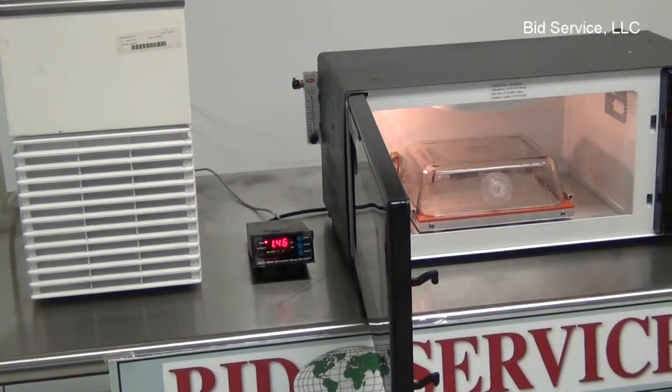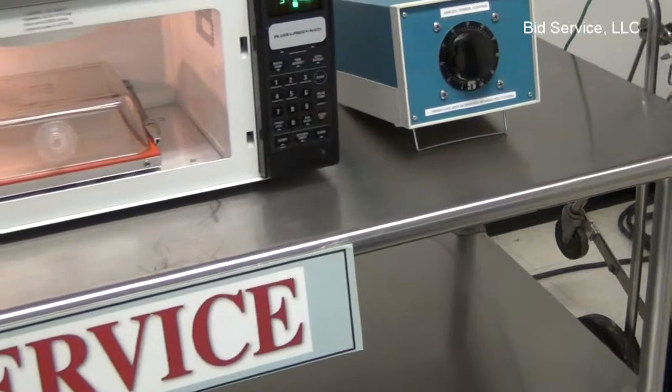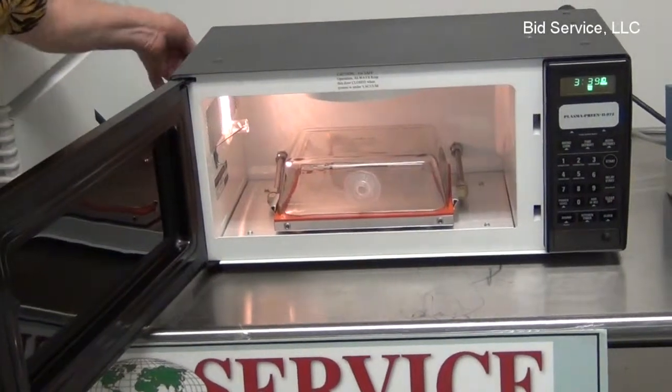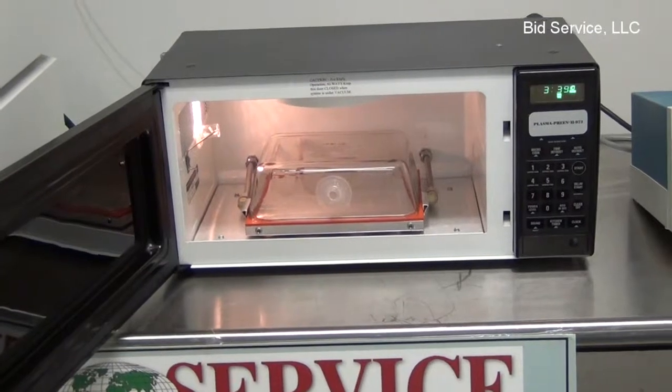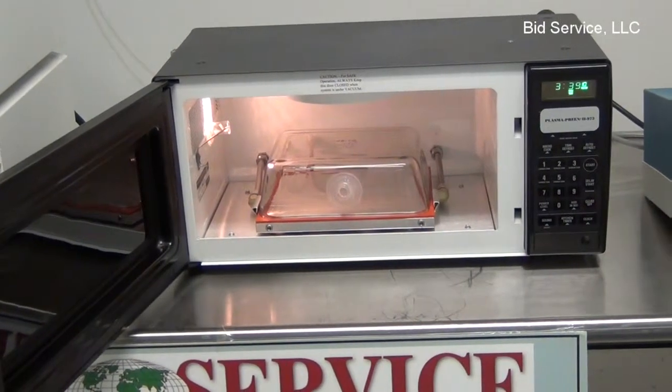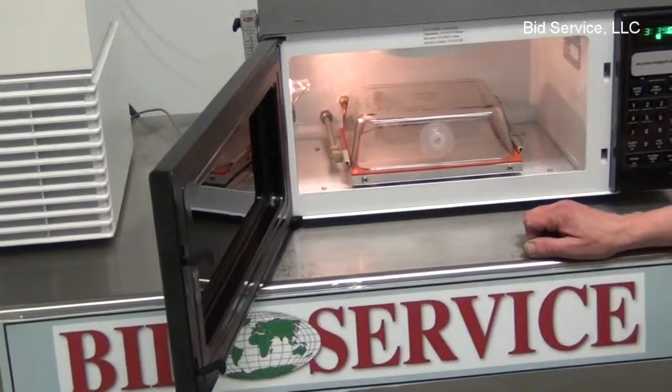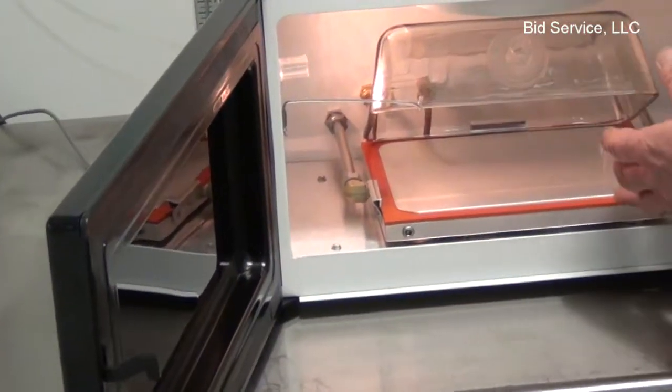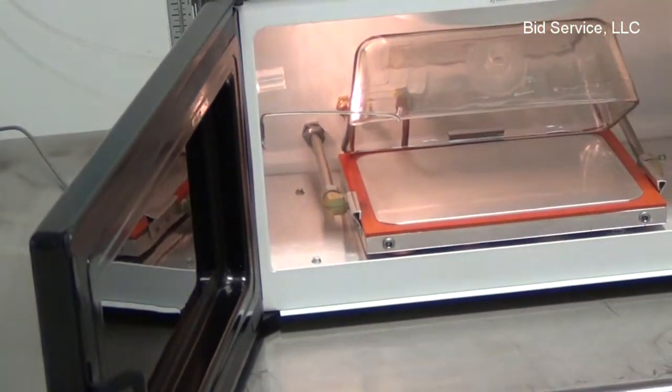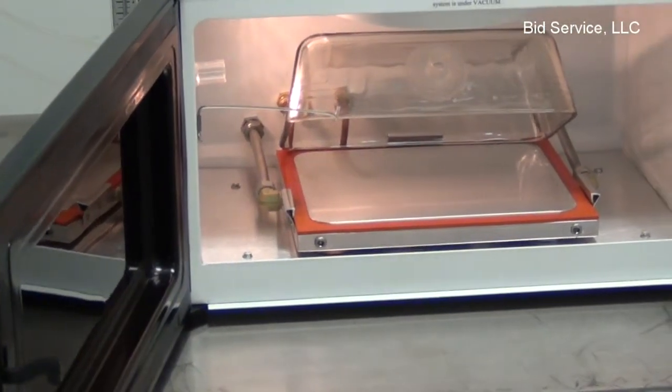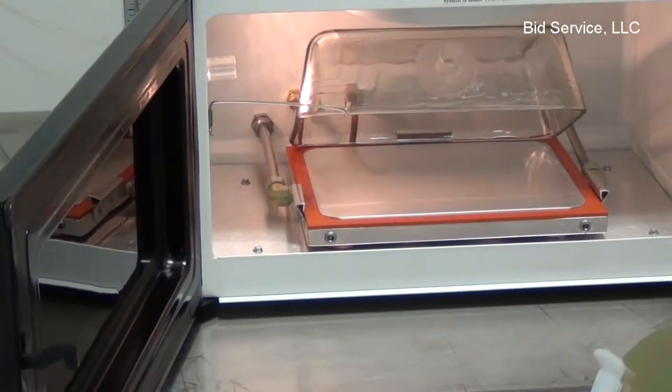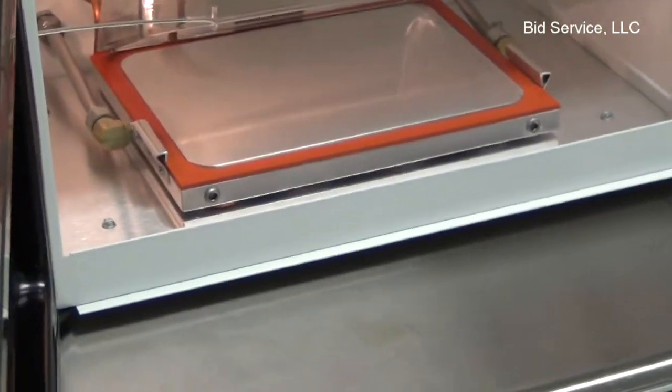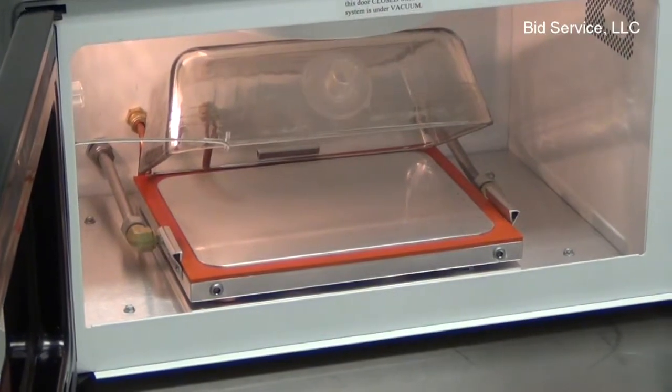Just to show you how you would load a product into there, if we were to purge it, turn off our vacuum, purge the bell jar. And the people at Plasma Systems made it very nice, simple, very simple, nice to hold. So you can put your workpiece in and out very comfortably. So a typical application of this type of oven, for example, would be to clean photo resist off of wafers. And it is also used quite a bit in the optical industry as well, as far as perfecting good optics and other components used in that industry.